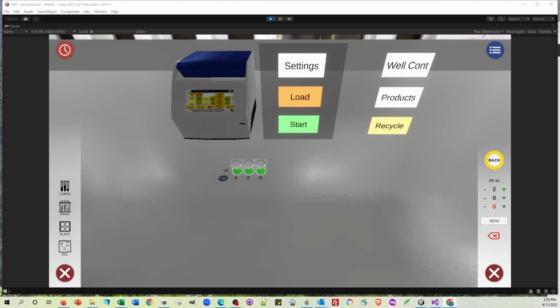And that's done numerically. So if one product is really dominant on a gel, you might not see some of the fainter tracks, whereas you see the numbers on here. Now, ultimately, of course, those numbers are going to be translated into a gel pattern, but for the purposes of feedback and for the purposes of our testing, this works really well.